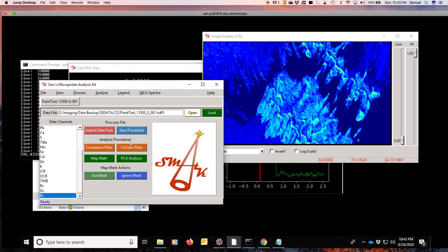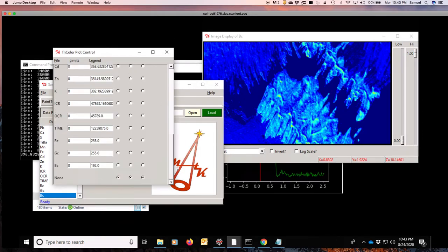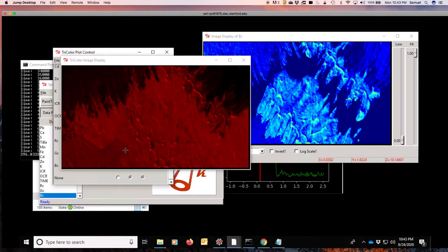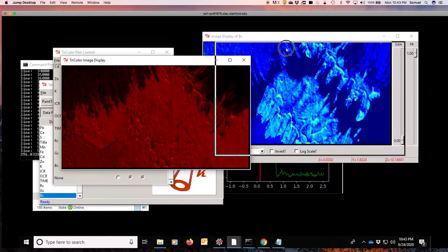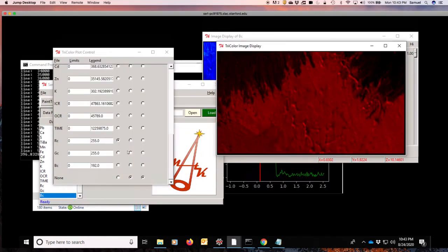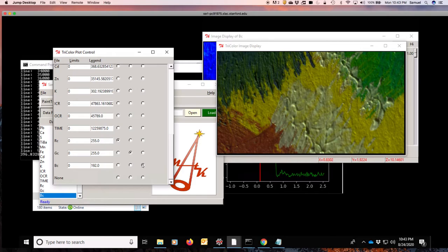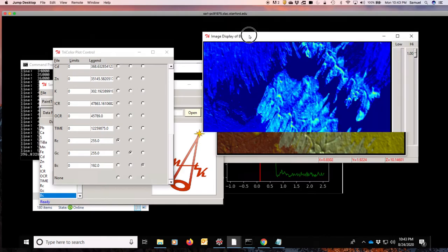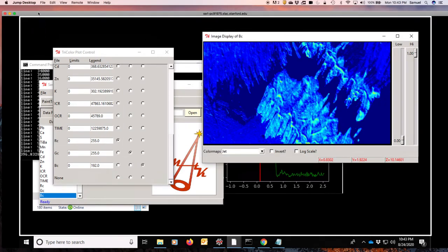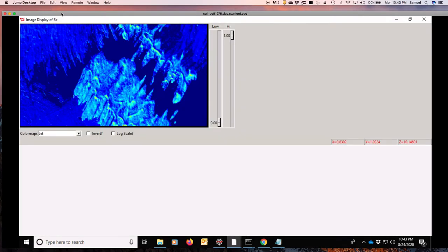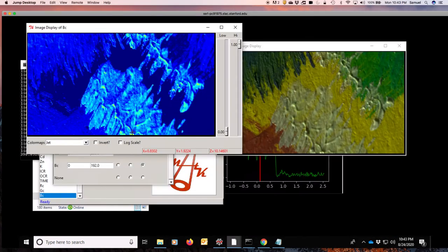To actually put this in an easy way to visualize, we can now go to the tricolor plots and visualize this as red, green, and blue. And now we have a true visual representation of the colors that are in that sample, and they match very well with the elements that we are also looking at.